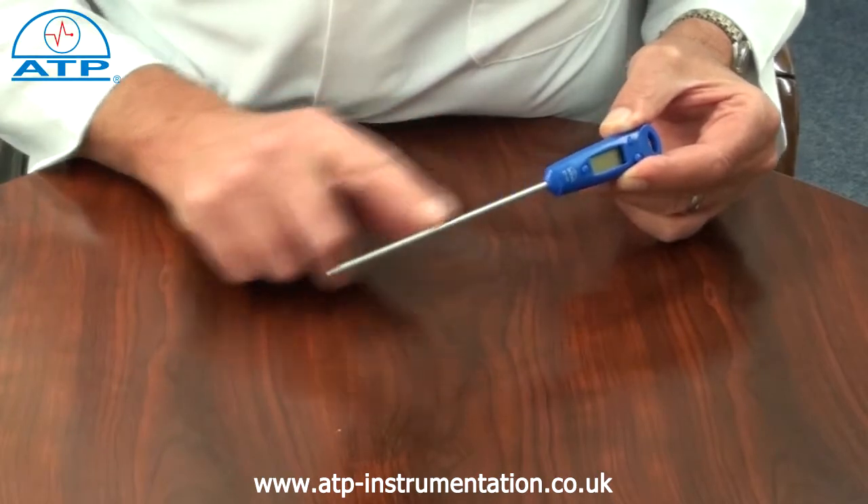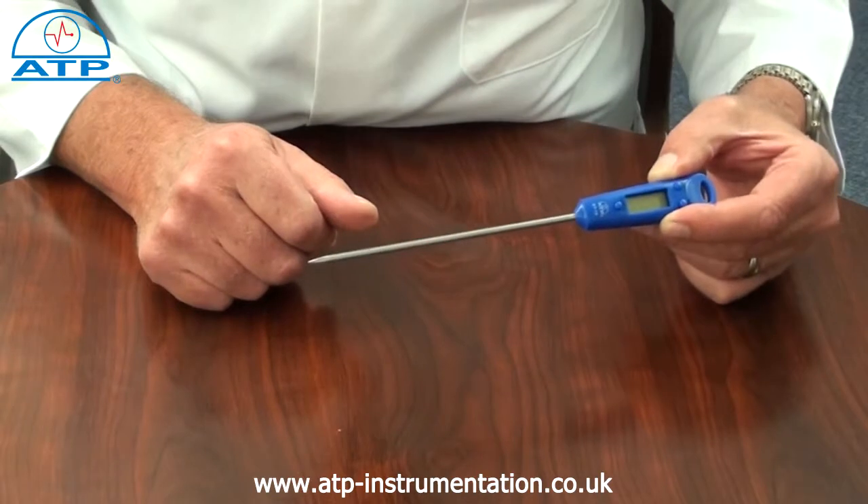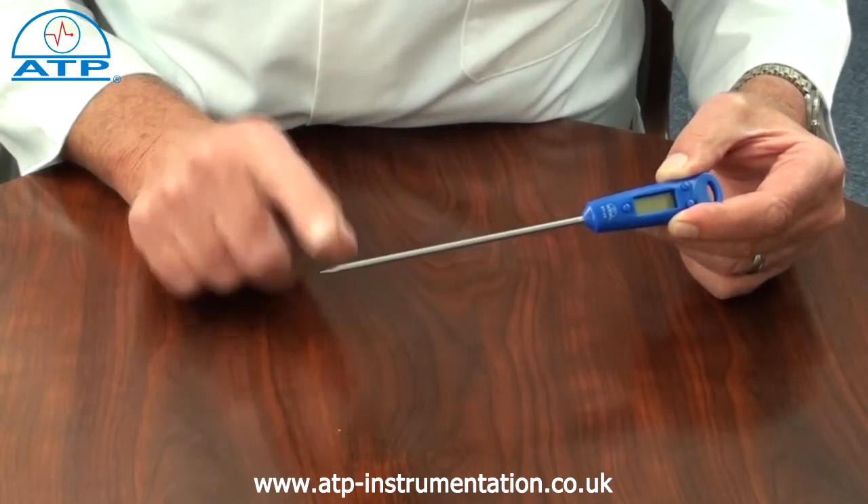The probe is 150mm in length and made from stainless steel with a swaged pointed tip. The temperature sensor is located in the bottom 10mm of the probe.